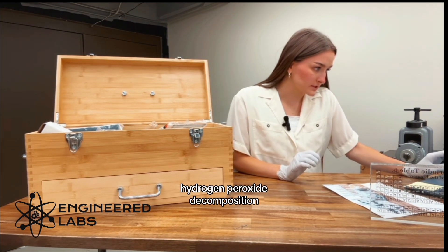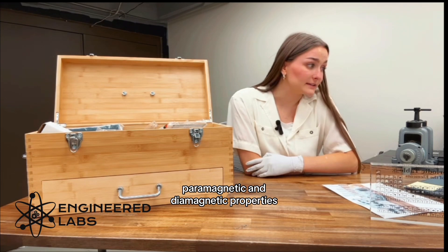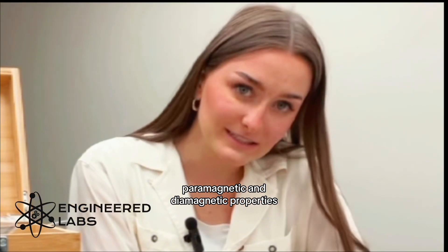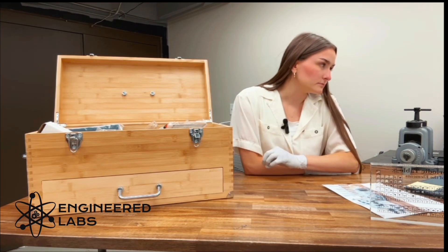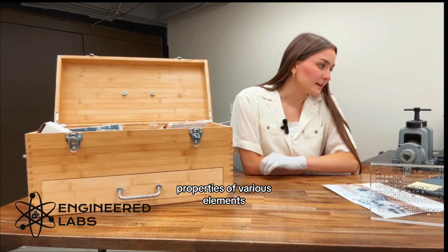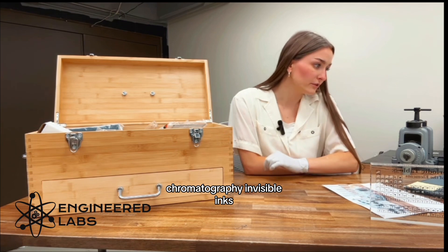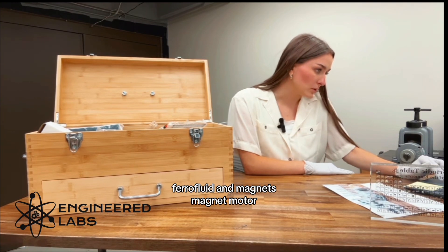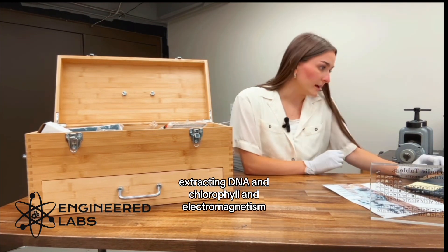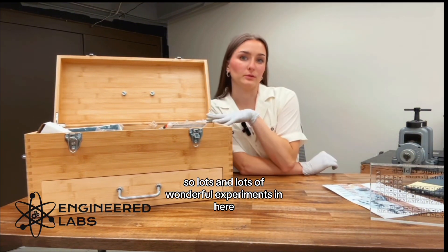Hydrogen peroxide decomposition, paramagnetic and diamagnetic properties, sodium acetate crystallization, properties of various elements, natural pH indicators, forensics experiments, chromatography, invisible inks, sodium hydroxide titration, ferrofluid and magnets, magnet motor, extracting DNA and chlorophyll, and electromagnetism. So lots and lots of wonderful experiments in here.